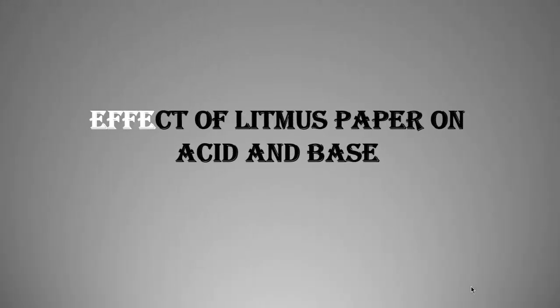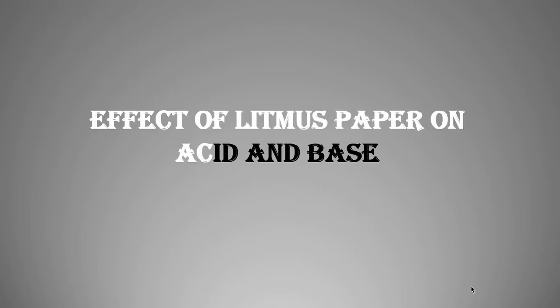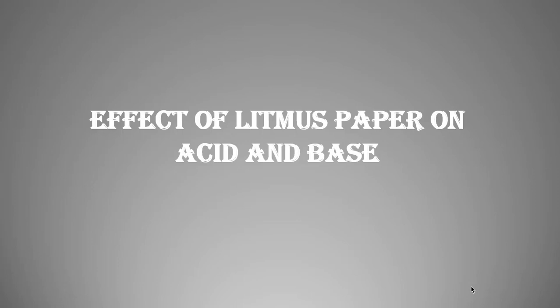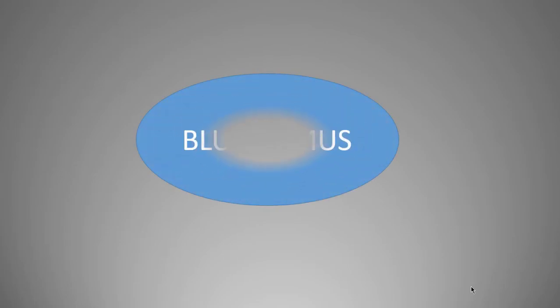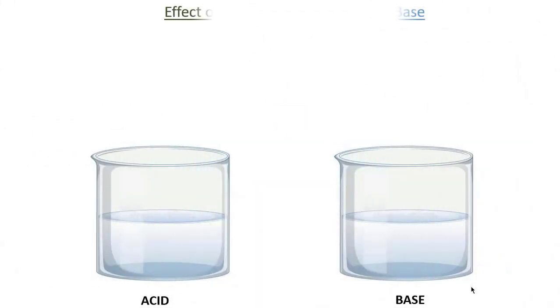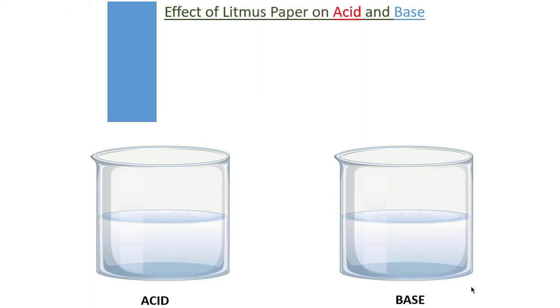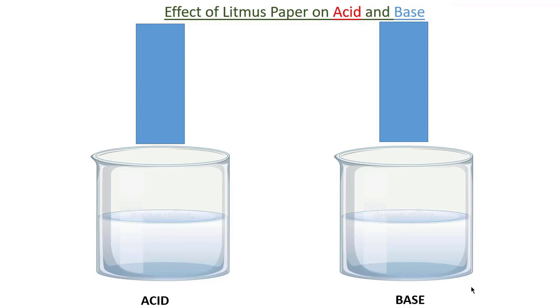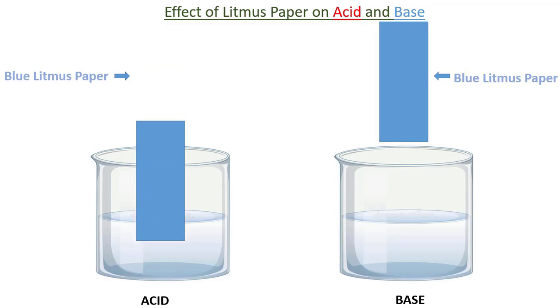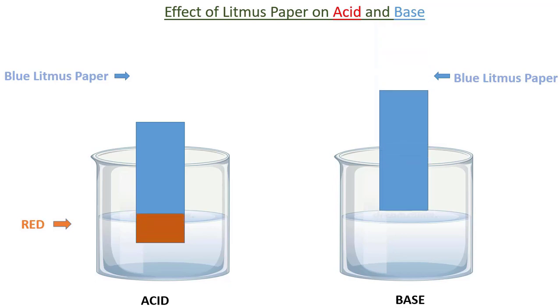Let's analyze the effect of litmus paper on acid and base. First, we will consider the blue litmus paper. There are two beakers containing acid and base solutions. We will dip the blue litmus paper in the acid solution first — the part of the litmus paper is being changed into red. Similarly, in the base solution, the color of the litmus paper remains unchanged.